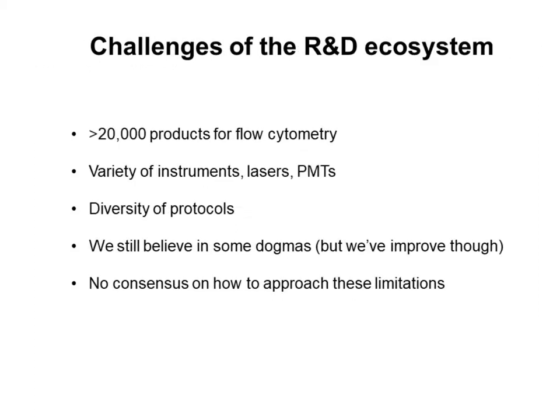On top of that, there are additional extrinsic challenges that could complicate the way each of us may manage a core facility. This includes the increased variability in the diversity of instruments and protocols, but also the immense number of reagents, fluorescent antibodies in this case, that are available to the community of cytometrists. These are not helping a lot to get a consensus, especially for newcomers in the field, on how to perform high-dimensional flow cytometry, especially regarding how to design panels.